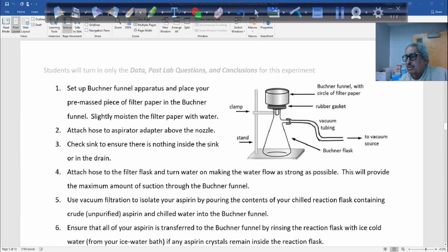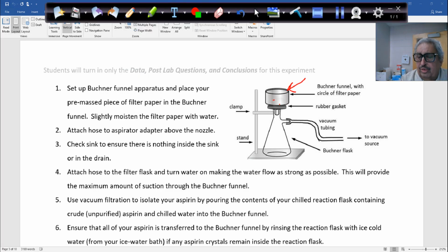This is called the Buchner funnel. It's made of hard ceramic or porcelain with many holes inside it. You will weigh a filter paper there with the names underneath. First write the names, and then weigh.